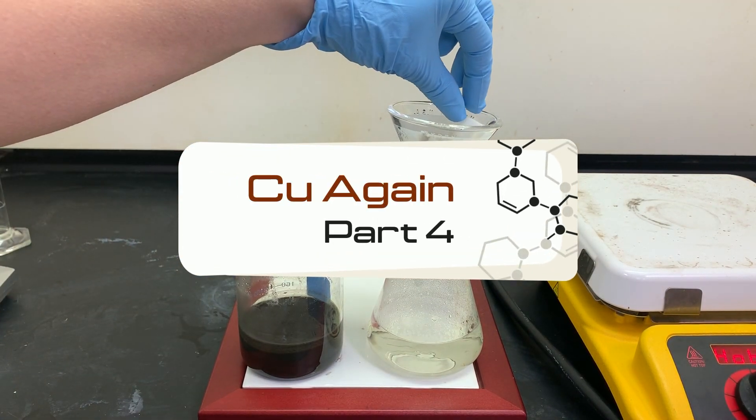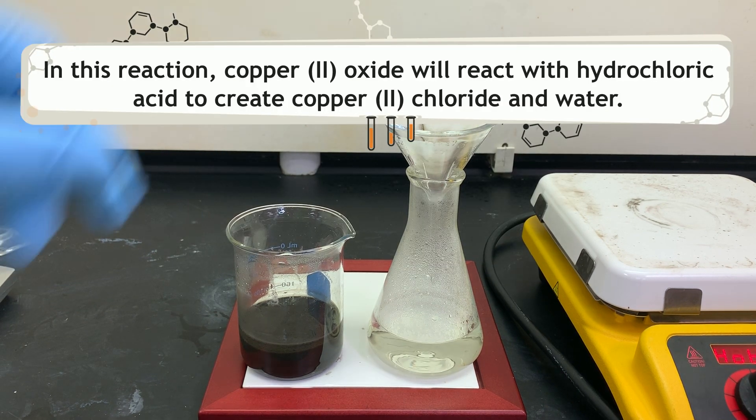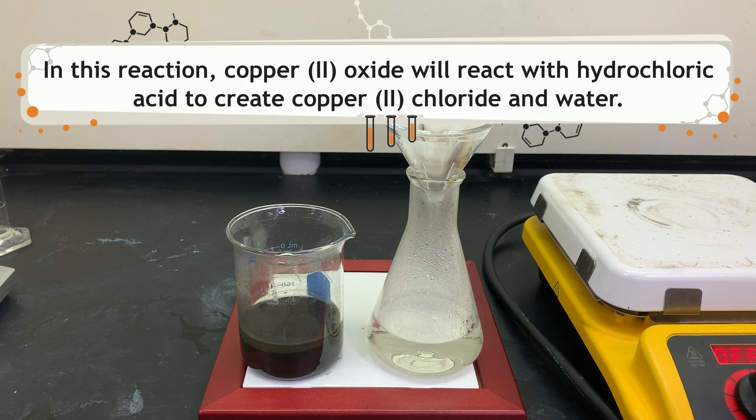Here we go with reaction number four. In this reaction, we will react copper oxide with hydrochloric acid. This will create copper chloride and water.